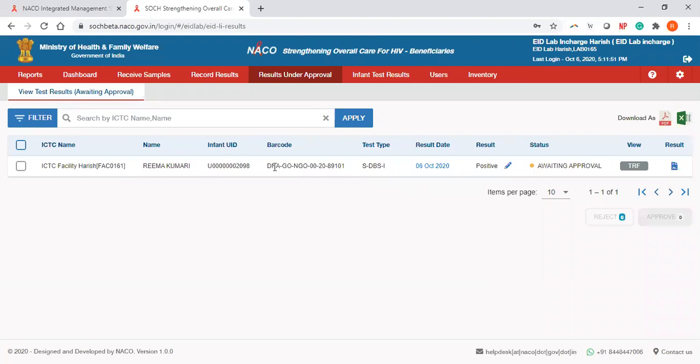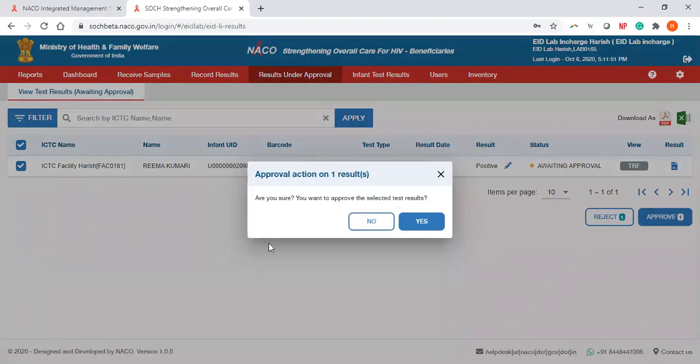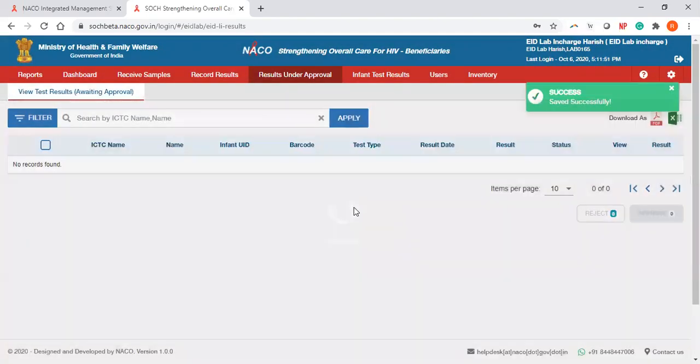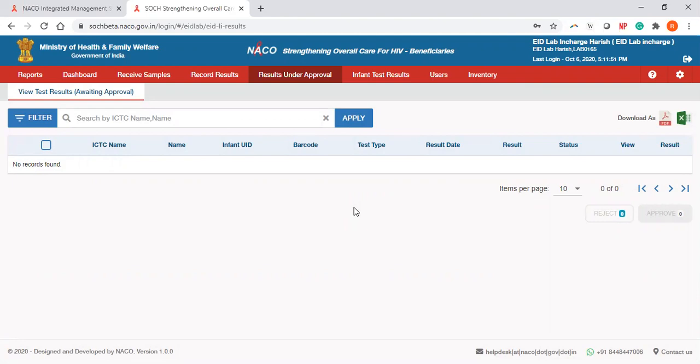However, in case everything is fine and the lab technician has updated the test result, please come to results under approval, select all the tests for which you need to approve, and click on approve. It will ask you for confirmation: are you sure you want to approve the selected test results? Click on yes, and the results are approved and available at the ICTC to be provided to the respective beneficiary.